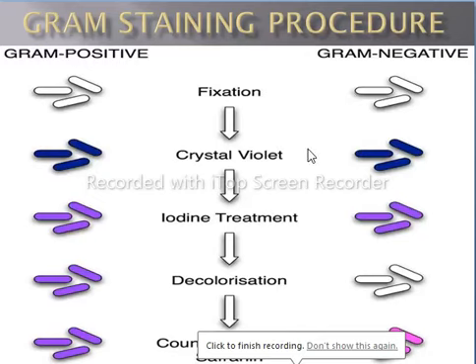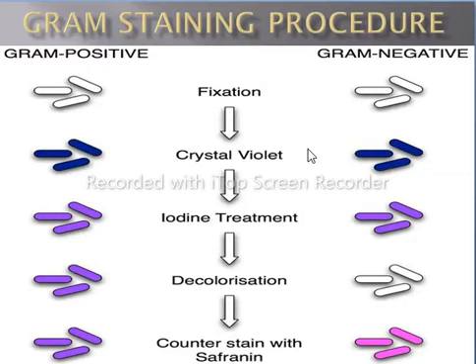In this video lecture, the topic under discussion is the Gram staining procedure. In this lecture we will discuss what Gram staining is and how we stain bacteria through different dyes, or through which procedure bacteria will stain. Let's start the lecture.